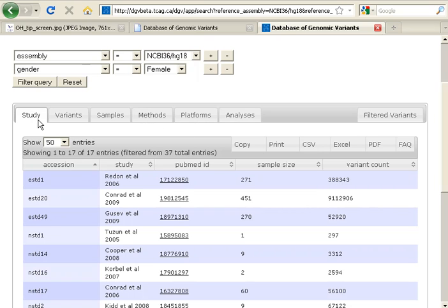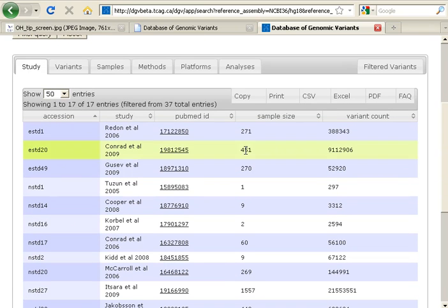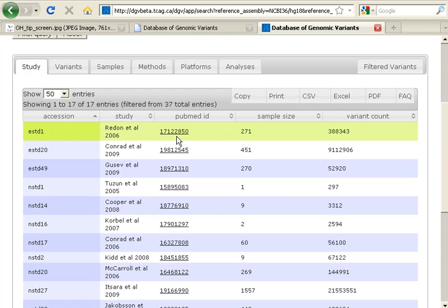By default, we're looking at the Study tab. You can see a variety of information offered about various studies that apply to our query, and each includes a link to the PubMed reference that describes the query. From results, you can copy, print, et cetera.